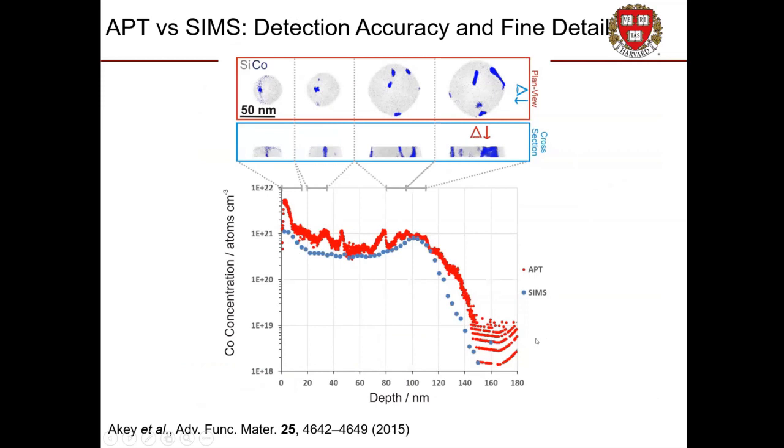If we just take an Atom Probe data set, slice it, and then average the contents of each slice together, we get the red curve, which, as you can see, reproduces the shape of the blue one very nicely, since these are both mass spectroscopies, although because Atom Probe is a smaller scale, more granular technique, we get some small excursions. But what we really care about is treating these two regions, the very blue and the not so blue, as separate materials, so we can understand how they might perform both separately and together.